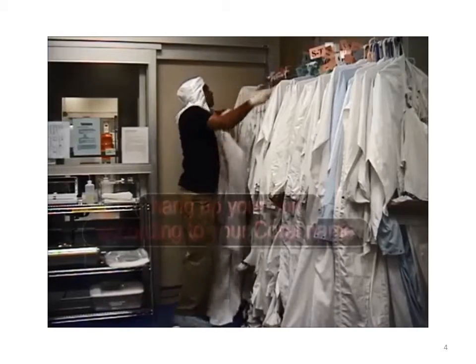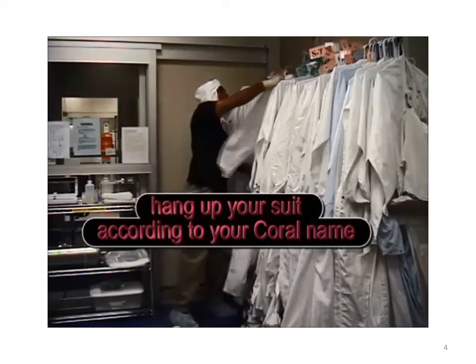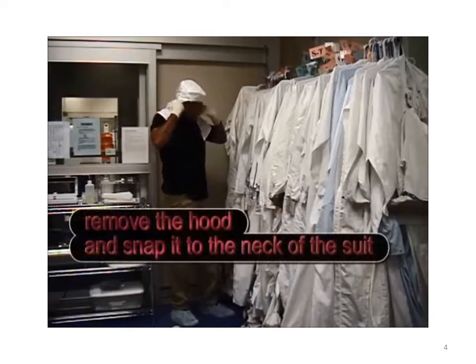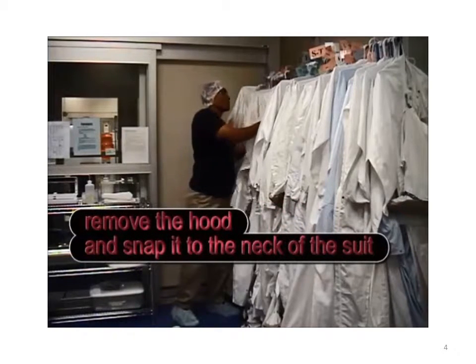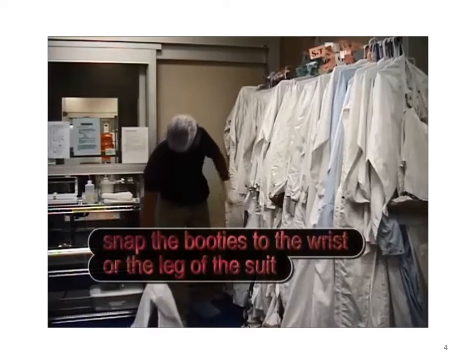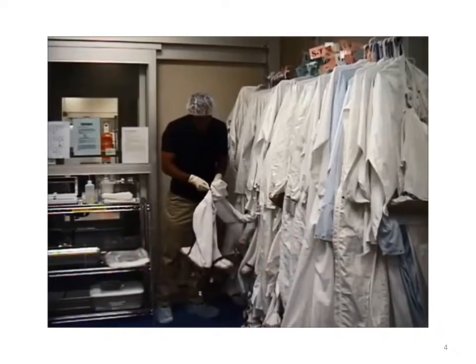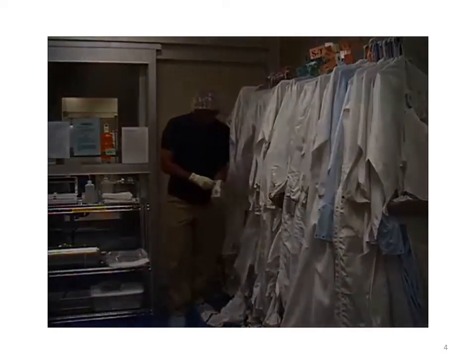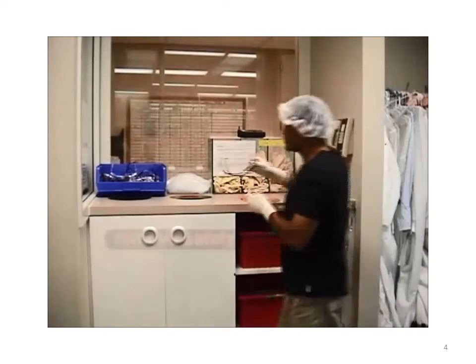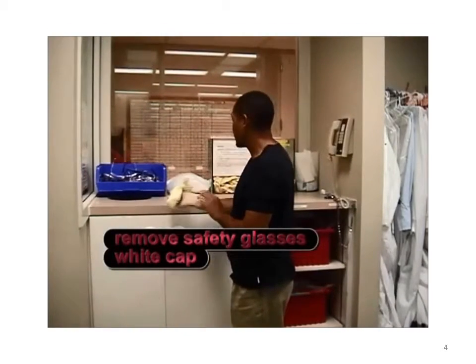Hang your bunny suit according to your Coral name. Then remove your hood and snap it to the neck of the bunny suit. Step outside of the gowning room and snap your booties to the wrist or leg of the bunny suit. Please change your bunny suit every two weeks, or more if needed. Remove your safety glasses, the white cap, and your gloves.